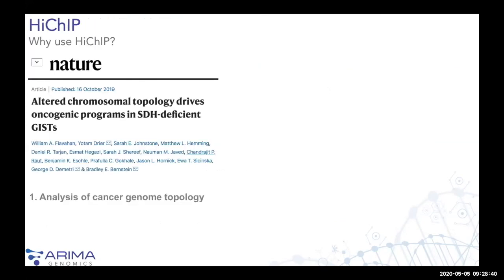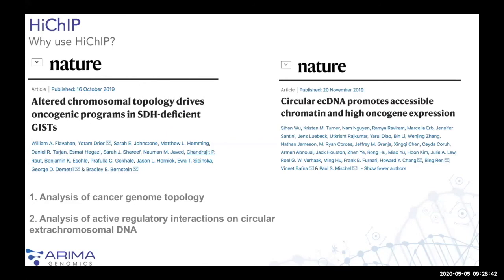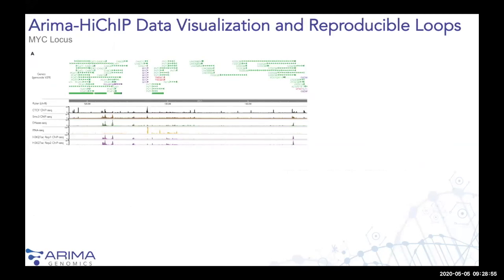Now, why use HiChIP? It's been used in the context of cancer epigenetics a couple times, here by the Bernstein lab and Paul Mischel's lab at UCSD. I would just point you to those papers.